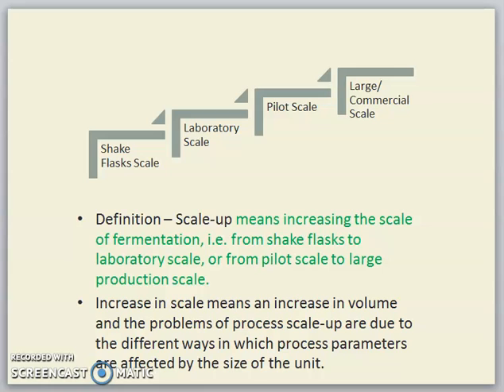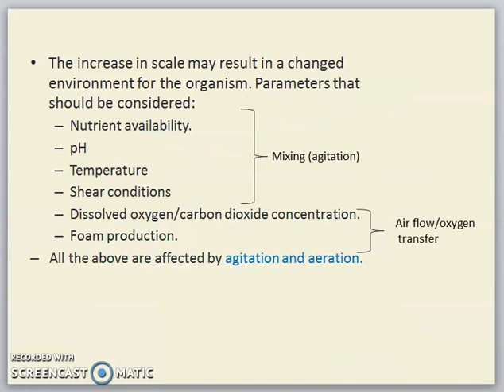Increase in the scale means that you have to increase the volume, and the problems of process scale are due to the different ways in which process parameters are affected by the size of the units itself. To increase in scale may result in a change of environment on the organism, the microbes.